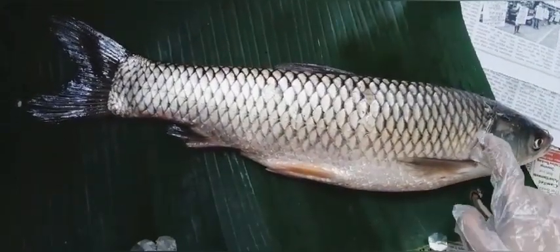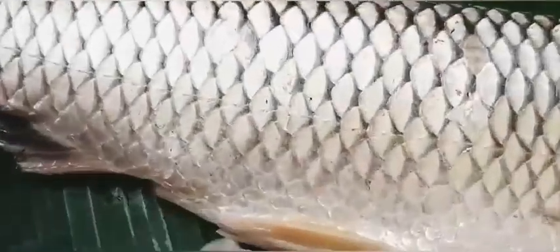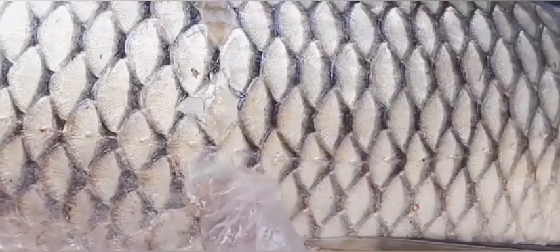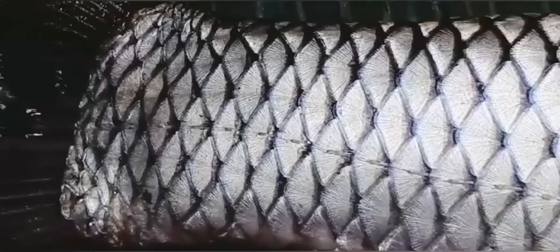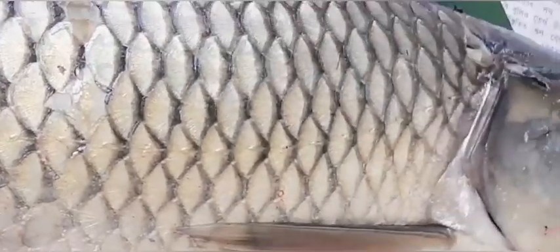Now if we look at the fish again and notice it, we can see that there is a line on the body of the fish. I am zooming in so that you can see. This is the line, and it is known as the lateral line, and it is very useful in fishes.